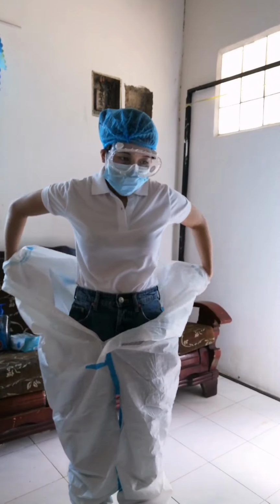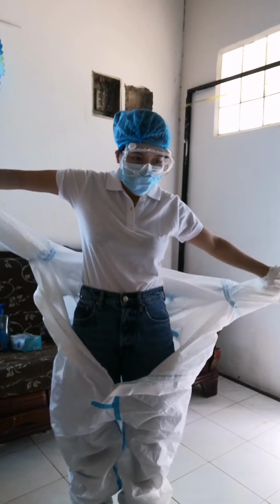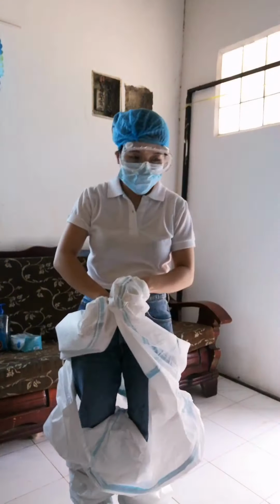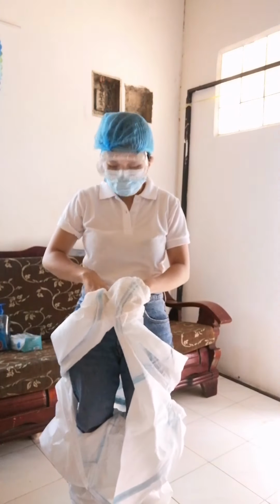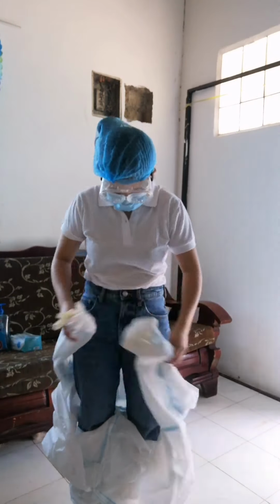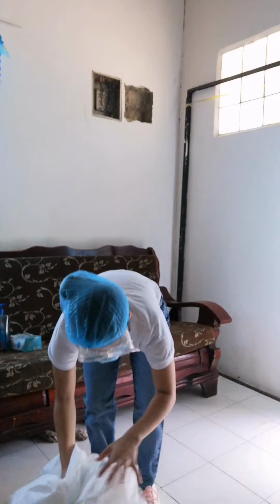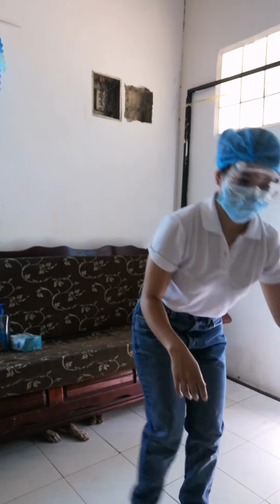So next is to turn the gown inside out, and roll it into a bundle and discard it into a waste container. This is mainly to avoid contact with the outside of the gloves and the outside of the gown that are exposed. We'll be disposing it here, in our bin.